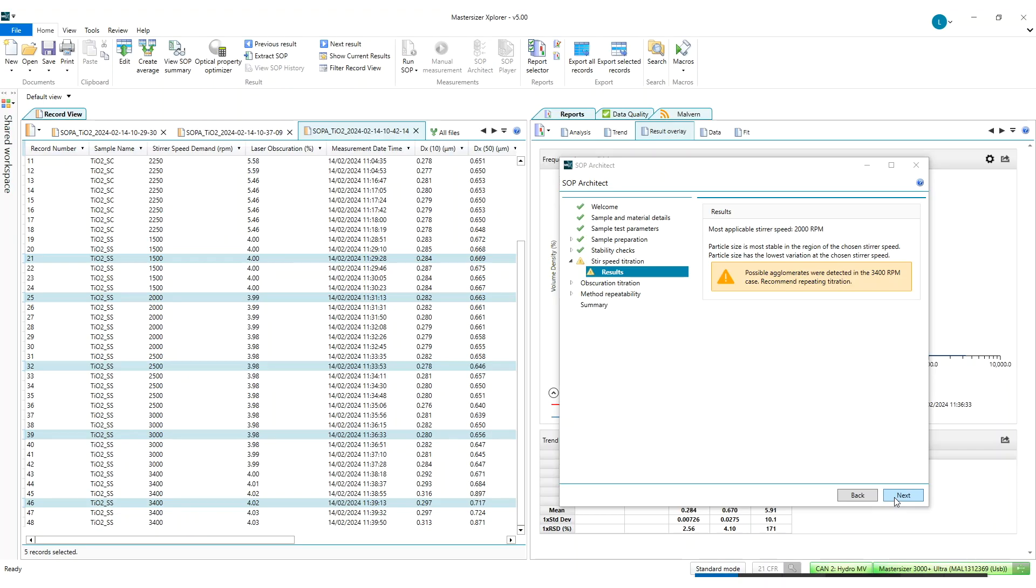So now that our stir speed titration has finished you can see that SOP Architect advises that the most optimum stir speed is 2000 rpm. In addition to this you'll also see that we have a warning come up on the screen saying that at higher stir speeds notably 3400 rpm we may be forming agglomerates.